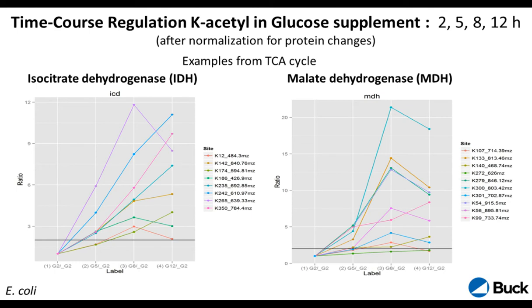So you have to treat each acetylation site as its own. Some start out slowly and at 2 hours have increased a little bit, and when you have different conditions, for example glucose supplement versus control without that supplement, some increase slowly and others skyrocket with very high fold changes, 10-fold changes. So it's really important to look at the individual acetylation sites, which is a very different mass spec question versus looking at protein expression changes.